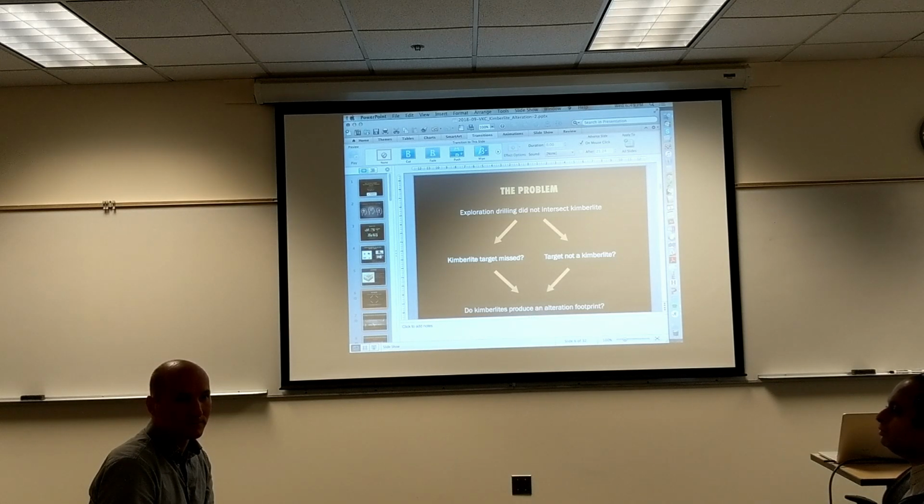And so you do have to let it dry on the surface. And you could have an air dryer drying it. This is also possible. It just has to be the surface. You don't have to dry everything. You just need the surface you're measuring to be dry. So if you touch it, it shouldn't go into the moisture.